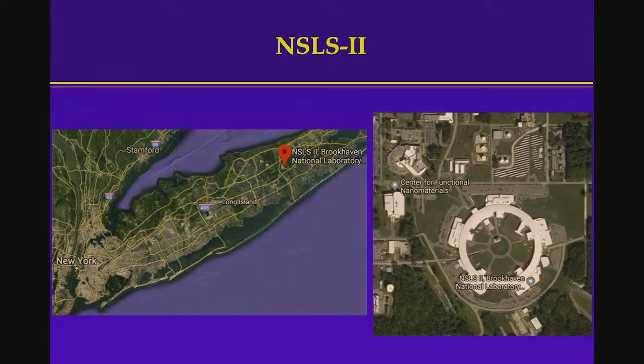Okay, so that's the new ring. The original ring is right here. You can see how small it is compared to this one here. So a lot more things can be done here now. Back when I was a student, even when I was first faculty, you had to go to the synchrotron yourself, in person, to do the experiments. Now, with robotics, you don't go there anymore. You just send everything there by FedEx. Send the crystal there by FedEx, and then you control everything using a web interface. And then you can basically examine your crystal at the ring and then do your experiment.